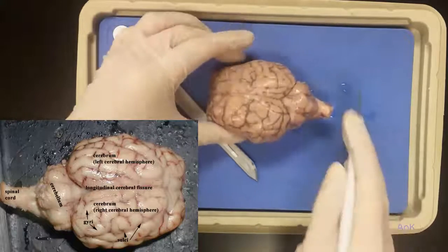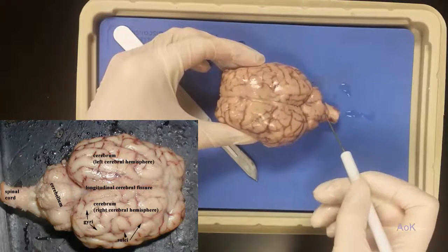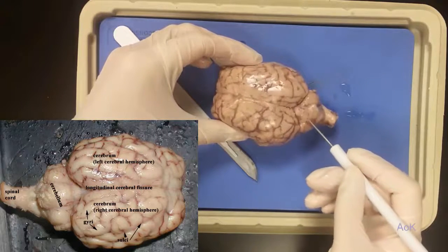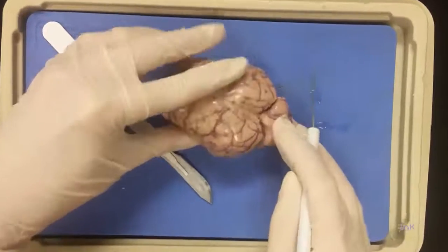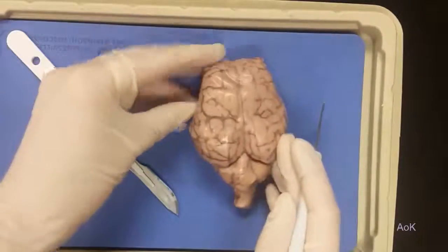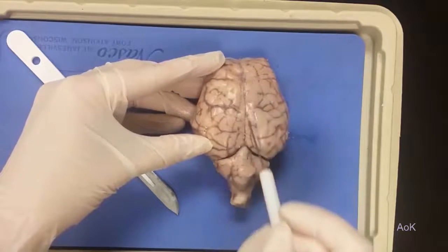At the top of the brain, we have the cerebrum and the cerebellum. The cerebrum and the cerebellum are divided by the transverse fissure right here. You can see it's quite a large gap. The left and right hemispheres are divided by the longitudinal fissure.